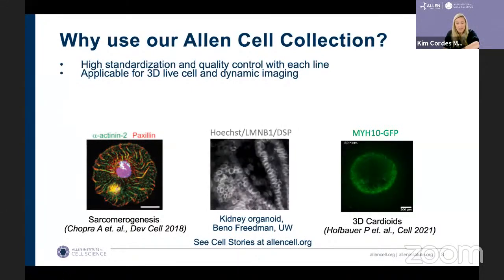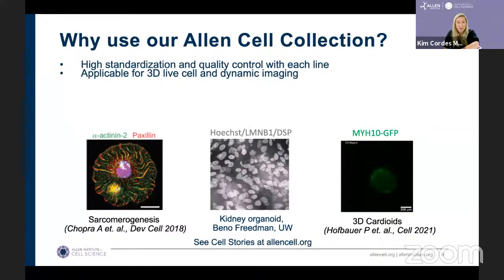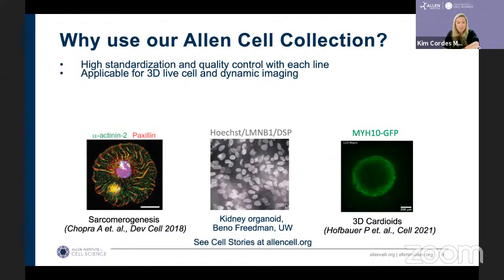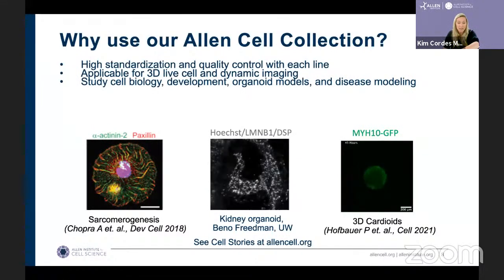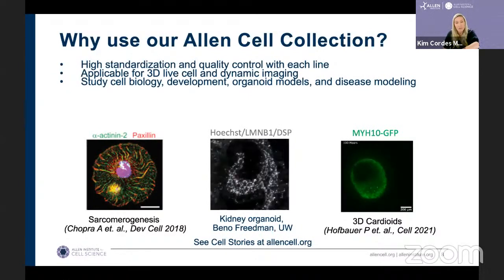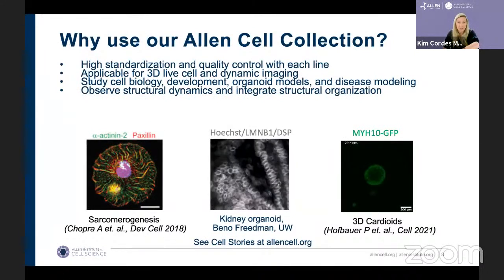And what they found is that they can recapitulate a cavity formation similar to the chambers of our heart. And so this allows the study of cell biology, development, organoid models as shown here, and even disease modeling approaches. You can observe structural dynamics and integrate structural organization.